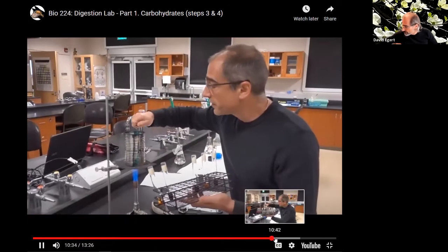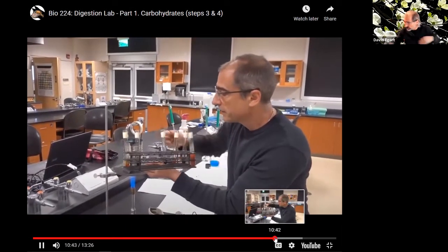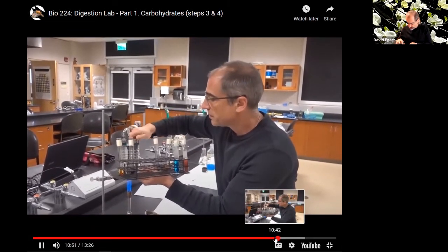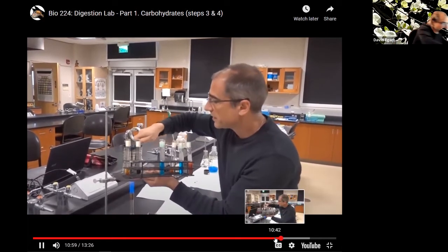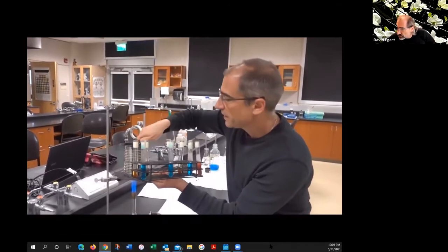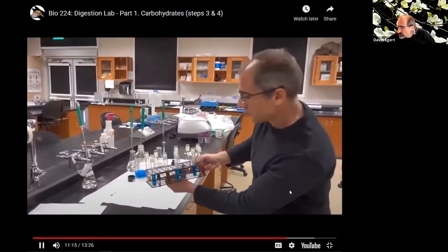All right, so these have had their 2 minutes in the boiling water. I'm going to carefully put them back in the rack here so we can see what happened. Here's our controls. And here we can turn off the fire. And now let's go take a look.